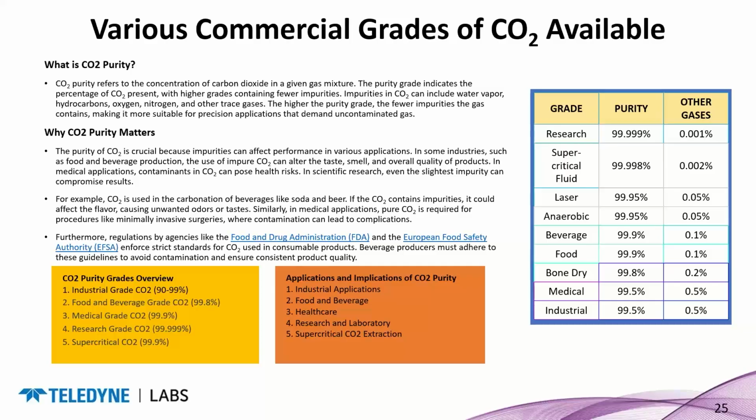If you pull the gas off the top of any dewar, that's one way of further purifying cruder material. So some people will buy the lower grade material and then draw off the gas and recompress that to a liquid before pumping it into the CO2 system.